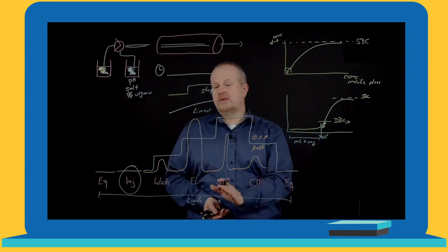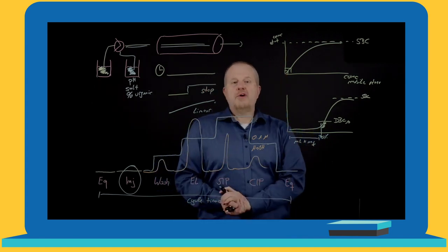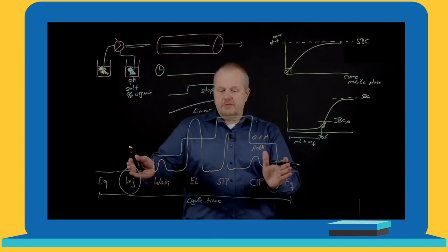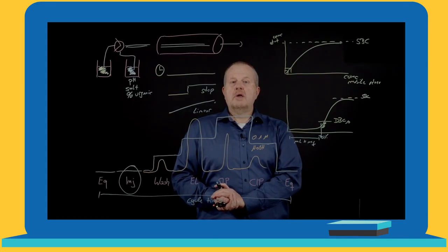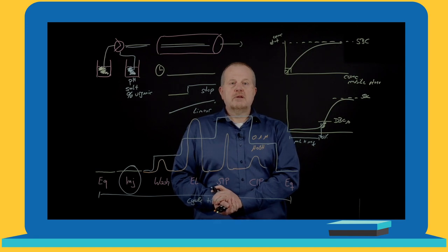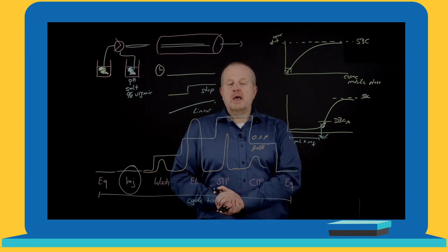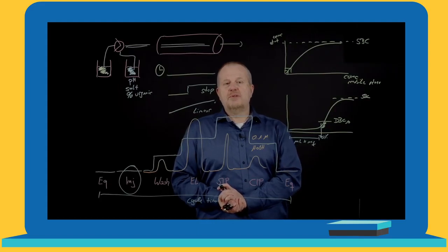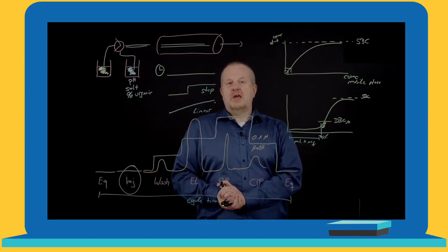Once you have determined all that, once you have found your optimum selectivity, once you have minimized your cycle time, you can run that in an automated fashion in columns up to 2 meter diameter, 24 hours a day, and you have your production process. And if you're developing these production processes, good luck to achieve the best productivity you can imagine.